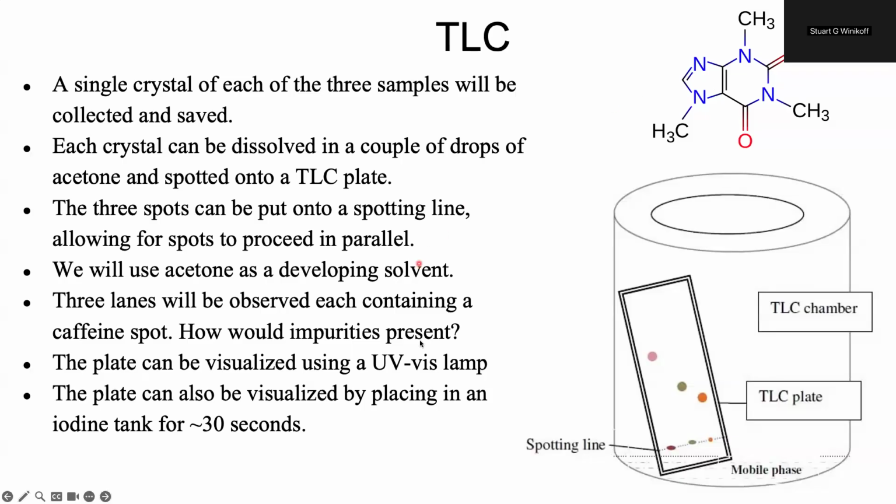So we can use these 2 methods to go ahead and try and visualize our caffeine spots, and then use these TLC plates to address our purity.